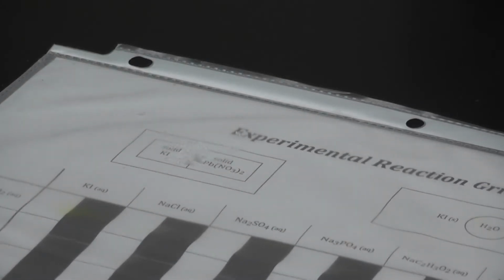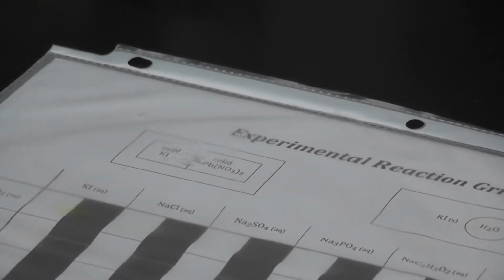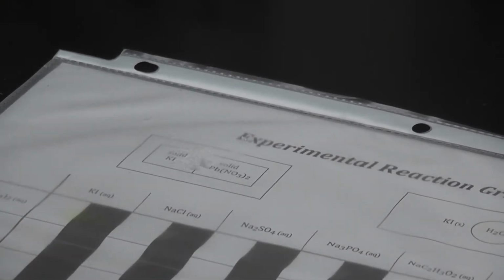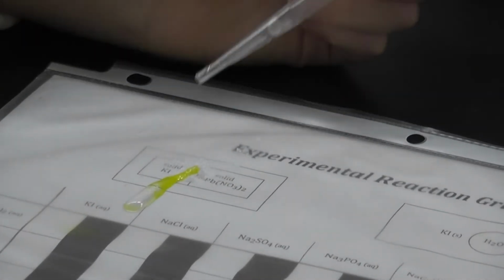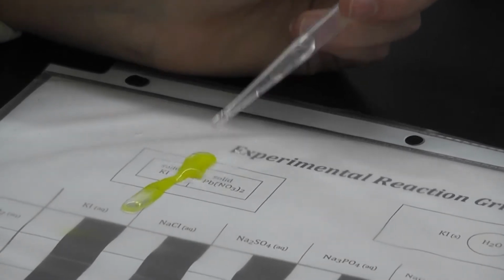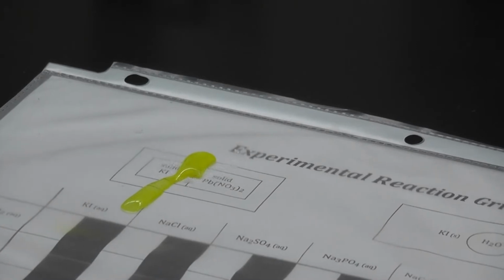So now, for the second part, after doing your observation, I'm going to add a few drops of water using this dropper and some DI water to the solids here. Okay, let's add a few drops of water. Whoop, a little too far. But you'll notice that something happened. This dropper. There we go. A few too many drops of water. But now record your observation of what happened.